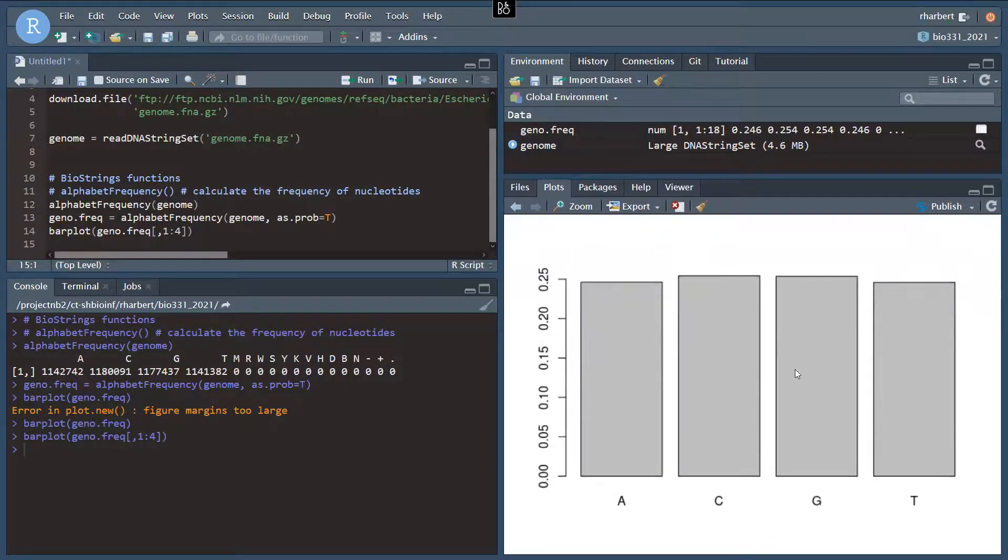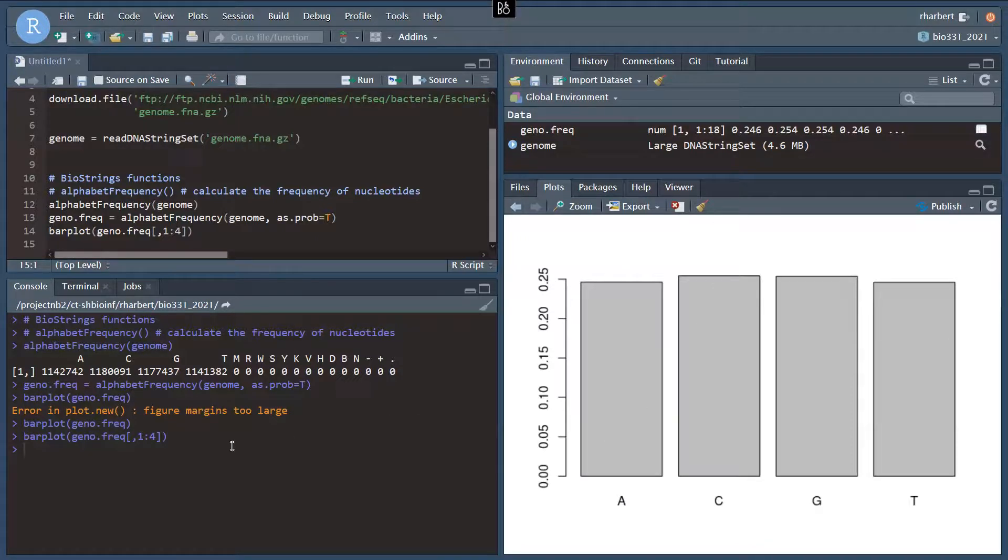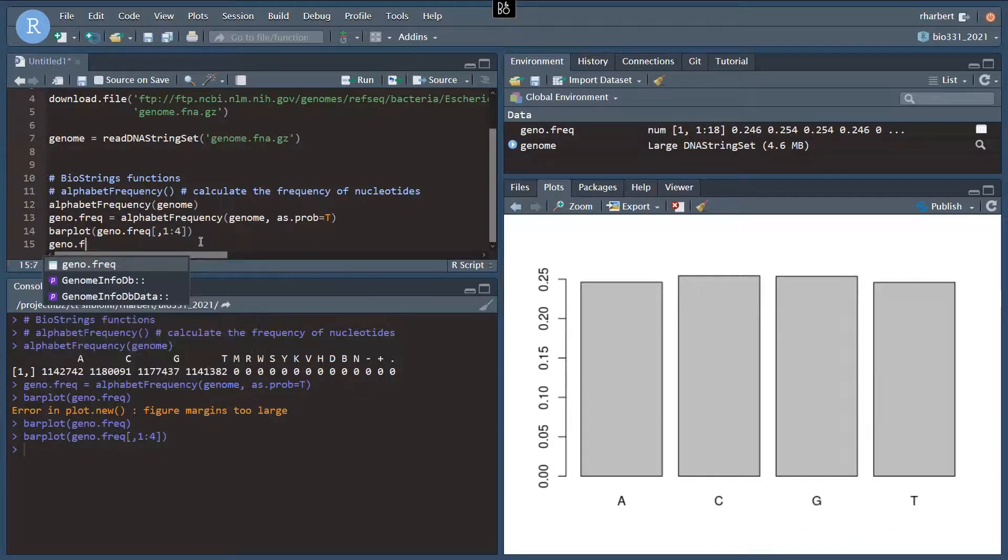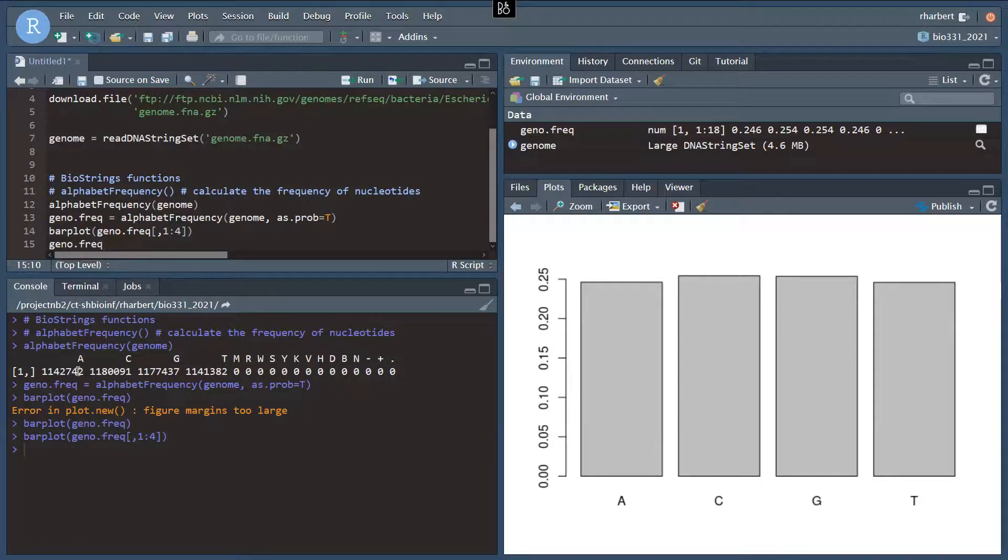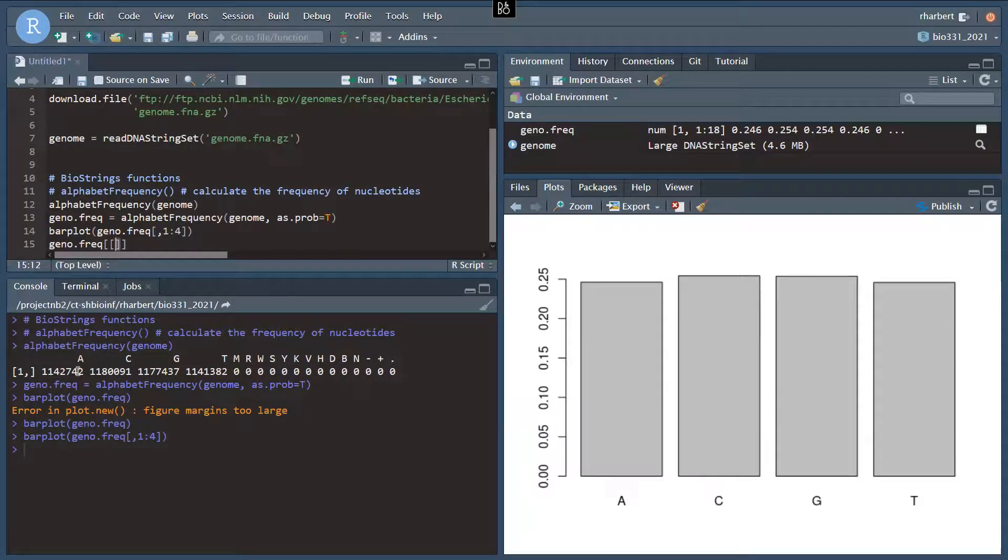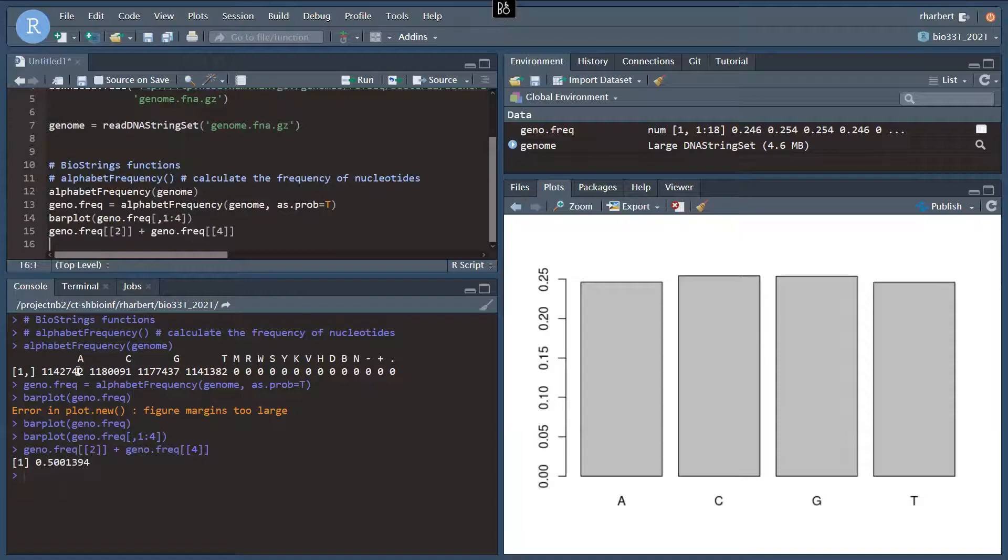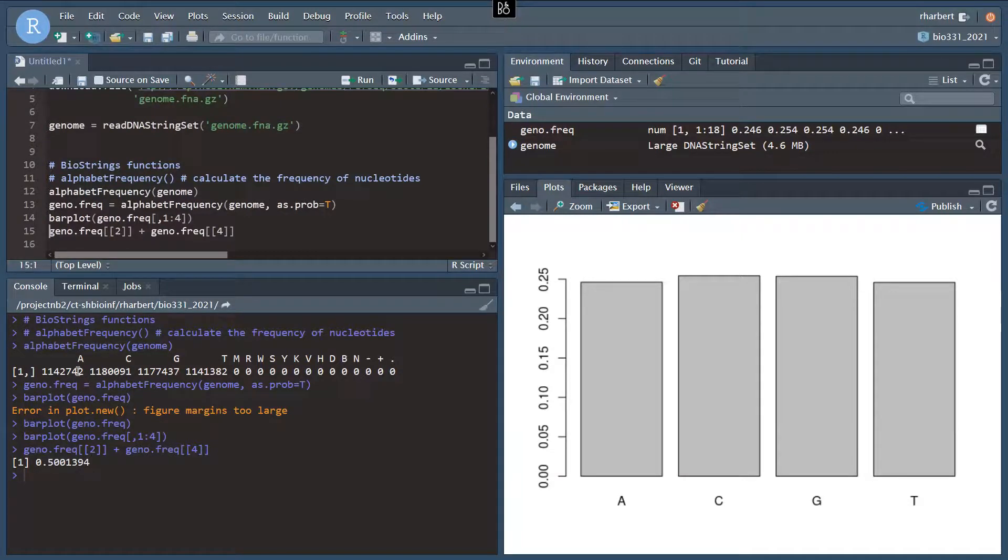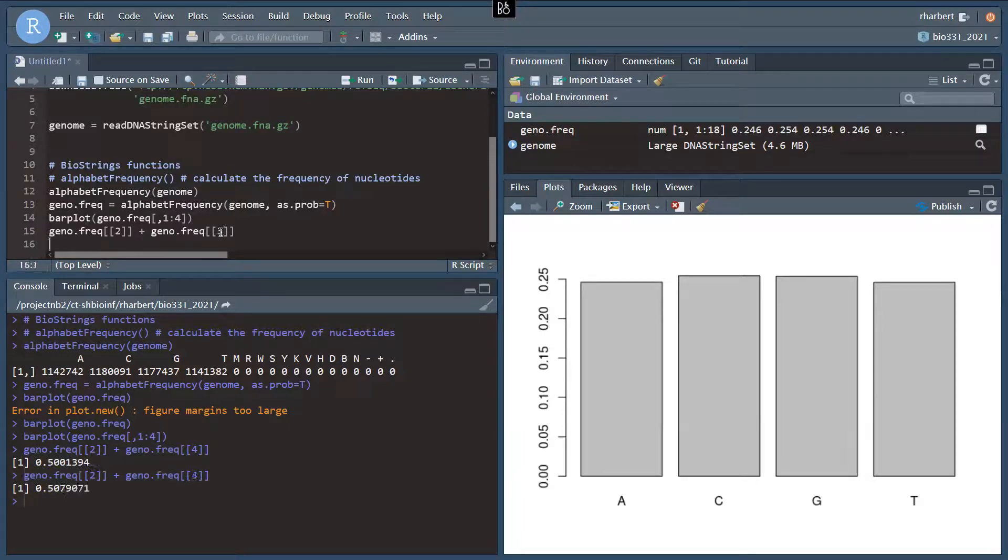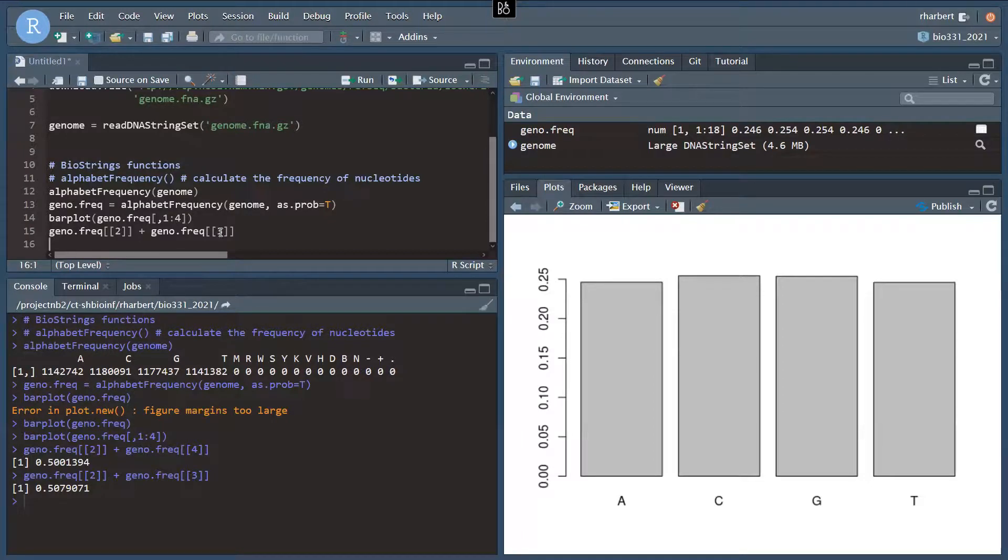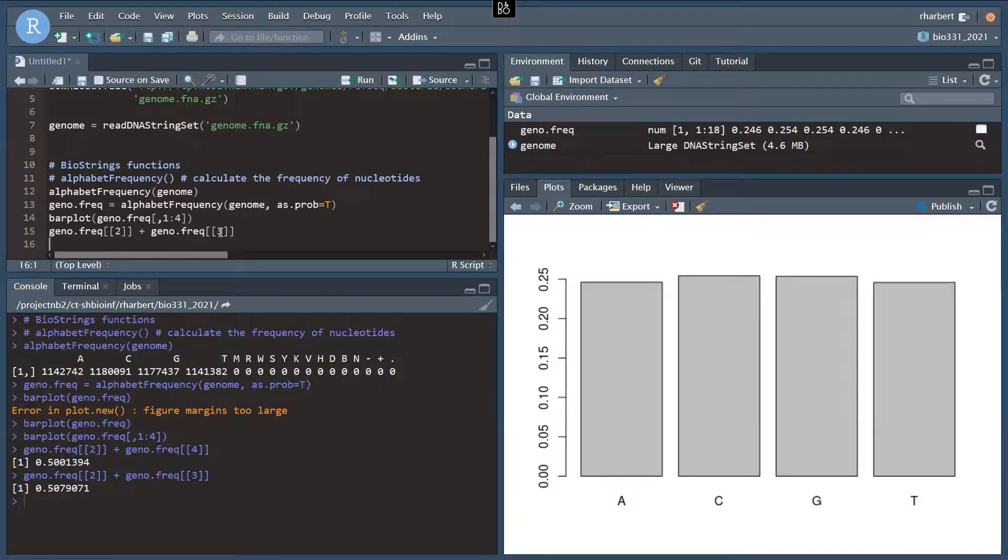So now we could see, when we visualize it, there's slightly more C's and G's than there are T's. But we could also get those calculations, we can access each of the frequencies using this index notation. So GC would be 2 plus 3. There we go. So it's 50.7%, almost 51% GC in this E. coli genome. So if you're familiar with GC content, that can be variable between genomes. And that might be something that you want to check on your own data.